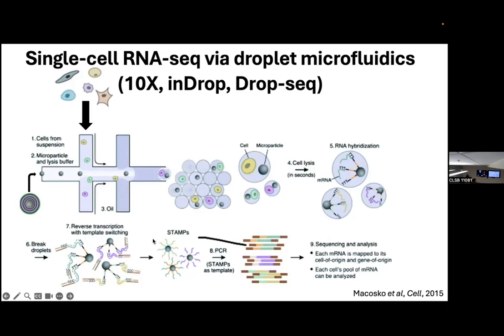So with all kinds of complicated molecular biology, you effectively generate a library where you have all of your transcripts, and ligated onto those transcripts are these molecular indexes, the UMIs, as well as the cell barcode, which tells us which cell those transcripts belonged to. Again, those barcodes are unique to the bead. And so when you co-capture one cell with one bead, everything in that cell gets labeled with the barcodes that were associated with that bead.